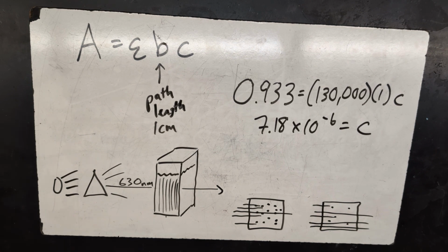Okay, so let's talk about that blue dye stock solution that we just made. We wanted to make sure that the absorbance was between 0.8 and 1.2 for our stock solution.